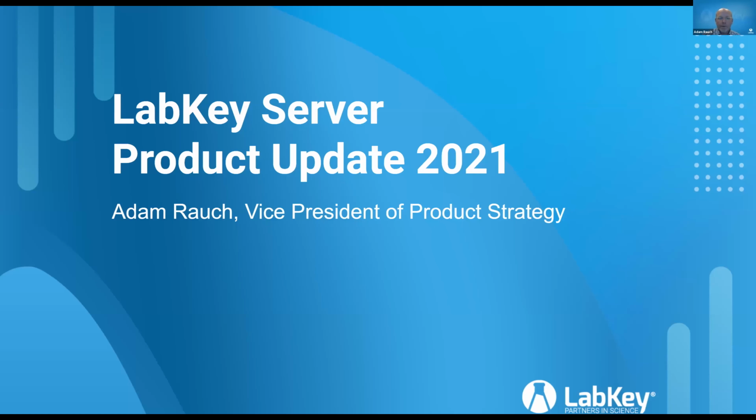So, Adam Rauch, co-founder of LabKey and vice president of product strategy here. I'm going to be saying a few words about LabKey Server and what we've been working on in particular for the last year or so.